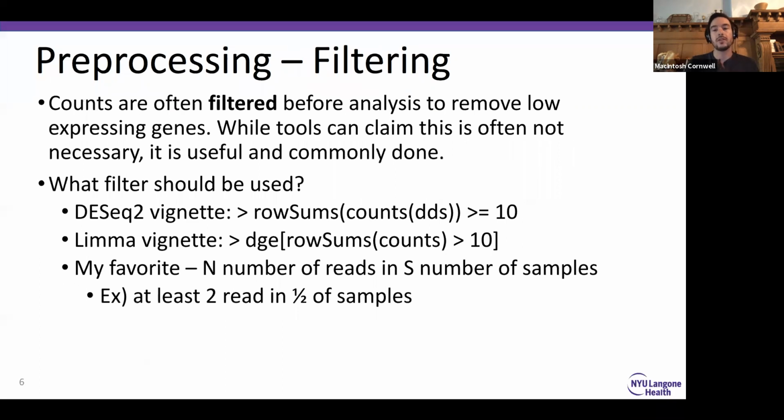So once you have your inputs set ready and you have your metadata and your count data, the first step before you do any type of analysis is some basic pre-processing steps. Now, a number of tools will actually say that you don't need to do any kind of filtering, but in general, it's still a good idea, and many workflows still start with this step.